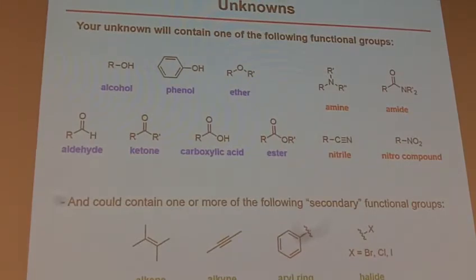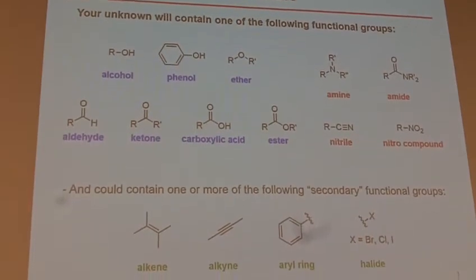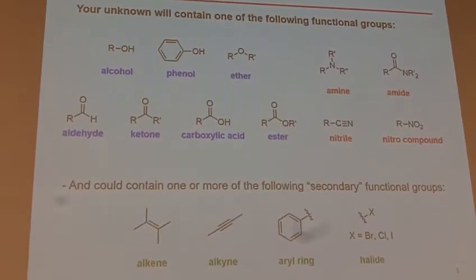All right, aromatic ring. Do we have a good way to figure that out? Not necessarily with chemical tests, but we'll talk here in a little bit about other tests that you're going to use. So IR is still one of the pieces of your toolbox, so you'll be collecting an IR spectrum of your unknown.